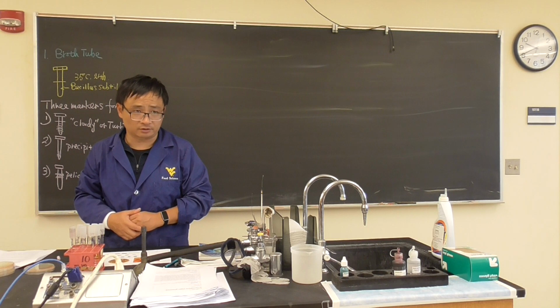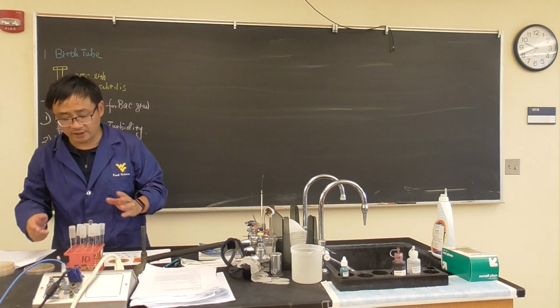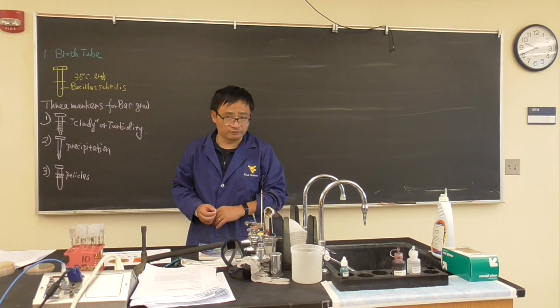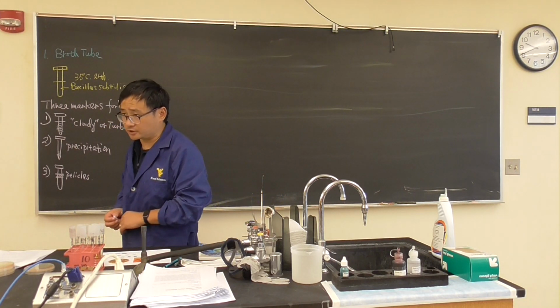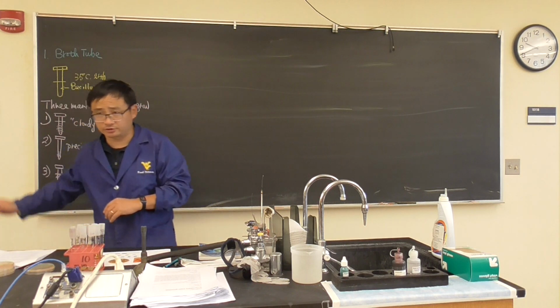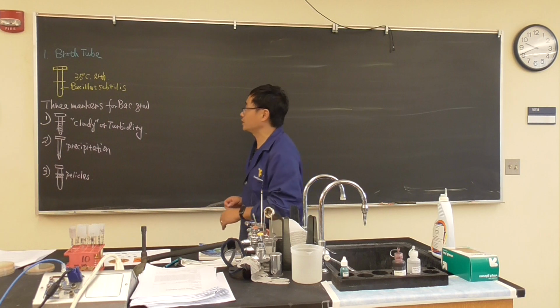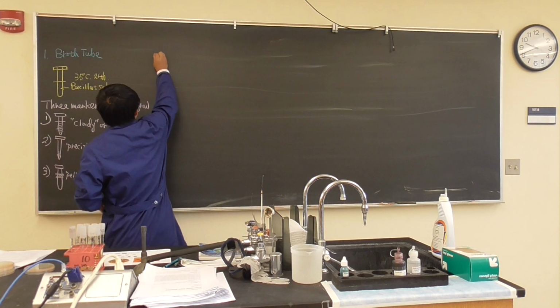It's already contaminated or expired. Okay, so that's important information. Same for the physiological saline. If you take the physiological saline bag from the refrigerator in the hospital and you see those 3 markers, it means it is already contaminated with microorganisms. So this is the first one.